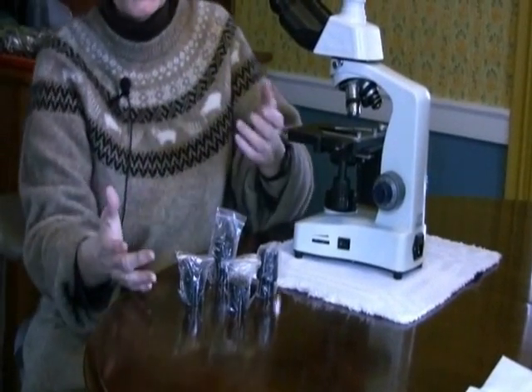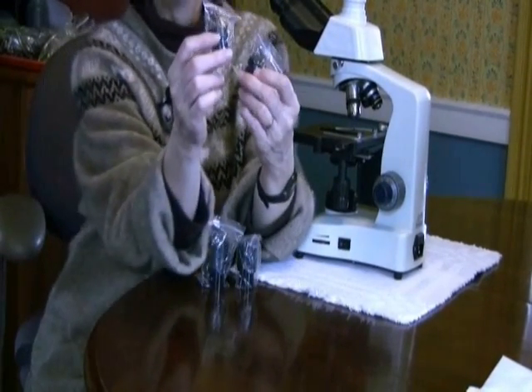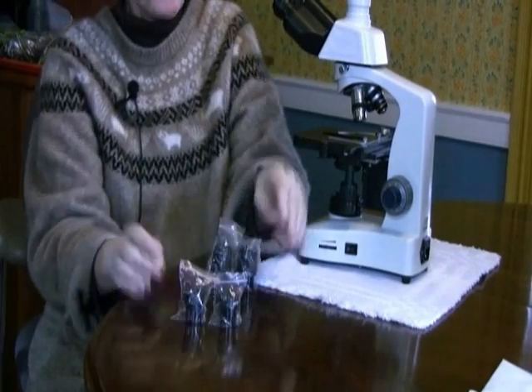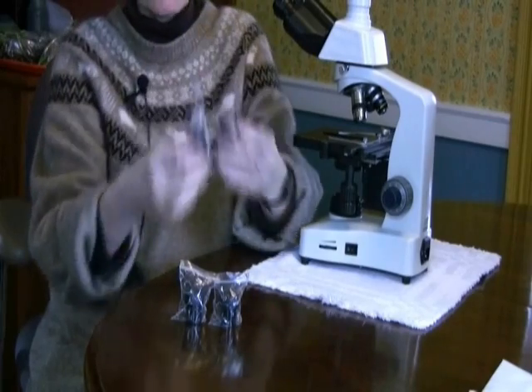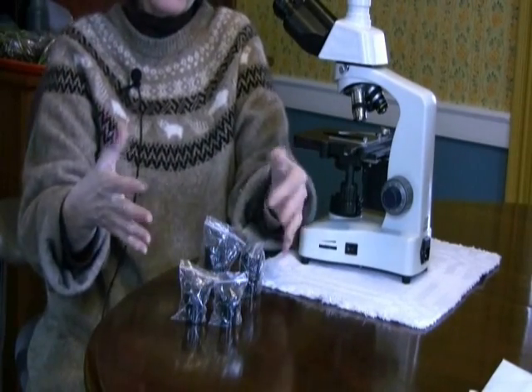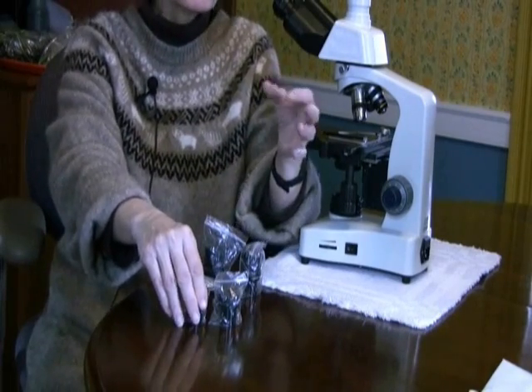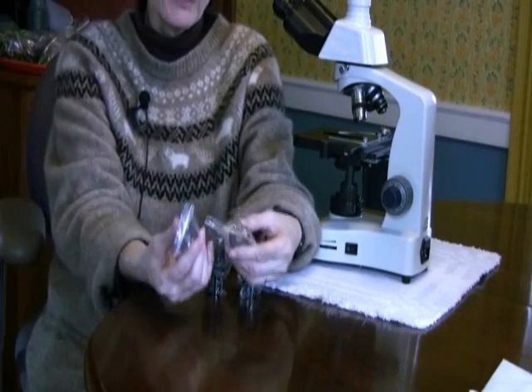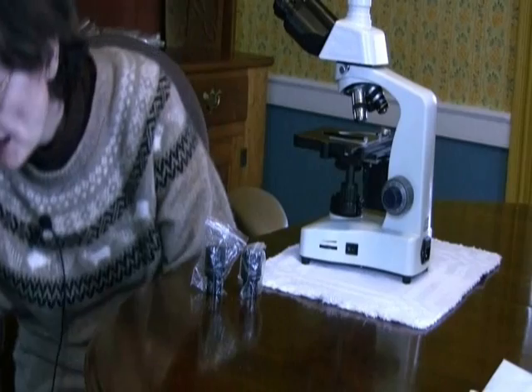So which one do you use? In this case, we have two 20x wide field eyepieces, a pair of them, and we have two 10x wide field eyepieces. Which one do you use? You would use the 10x. The 20x may be higher magnification, but it's empty magnification. You typically do not get an improvement in resolution when you're using the higher magnification eyepieces.